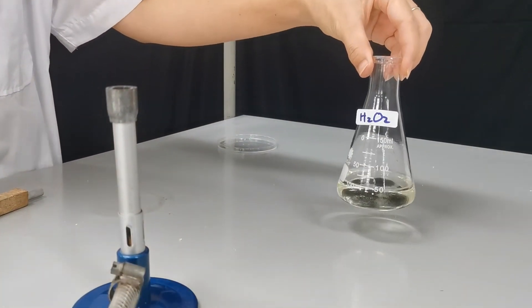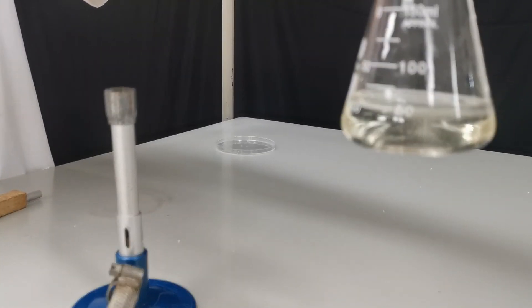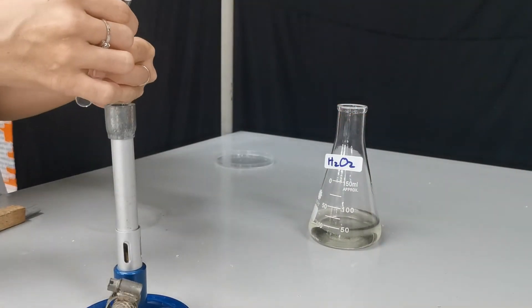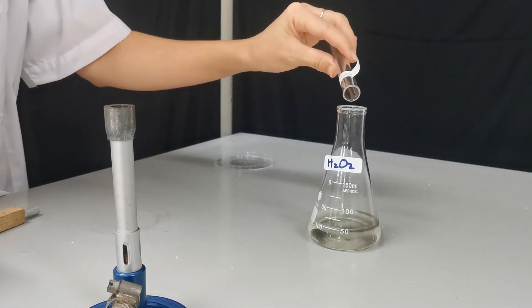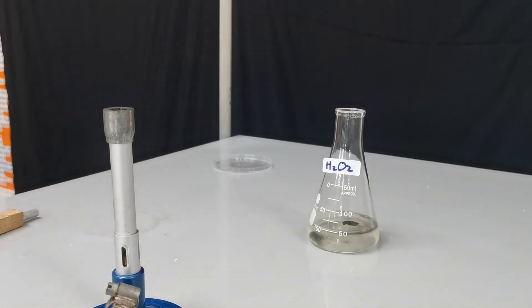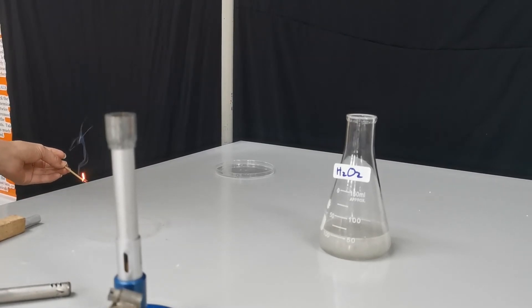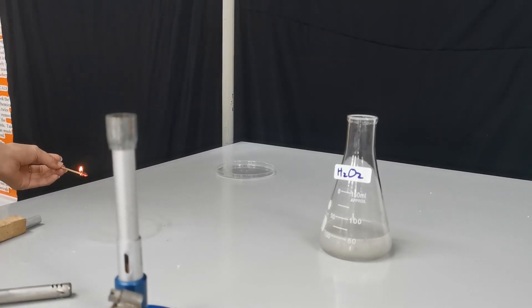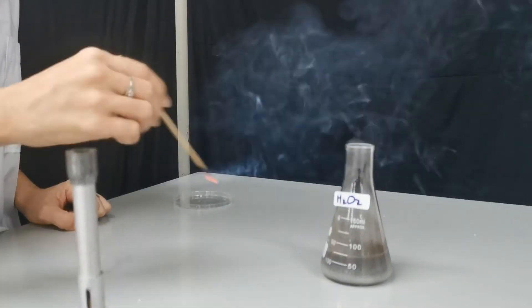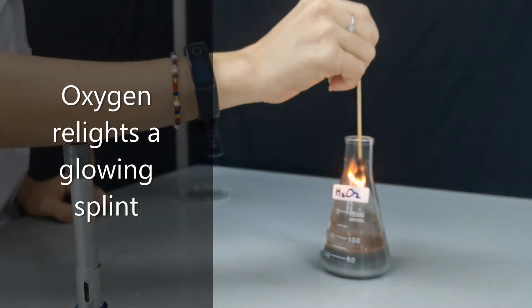You can see the fizzing happening and oxygen gas is being created. When there's enough oxygen gas produced, we introduce a glowing splint — and the glowing splint relights.